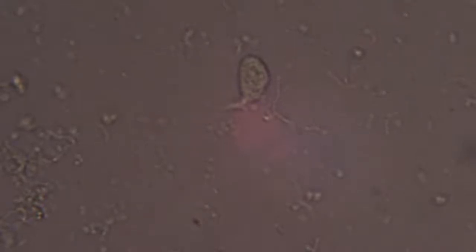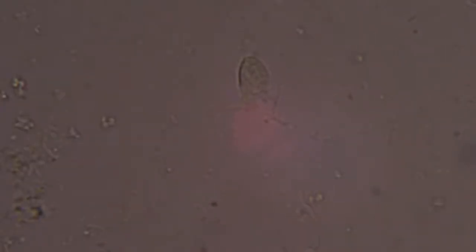Now, if you ever wondered about the power of isopropanol alcohol, one drop on the slide and everything is immediately toast. It's incredibly effective. So, as you know, it's used to disinfect when you get a shot or various other things, but it really works. It kills all this stuff instantly. And it's amazing to see it firsthand.